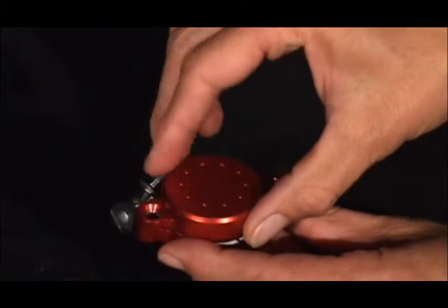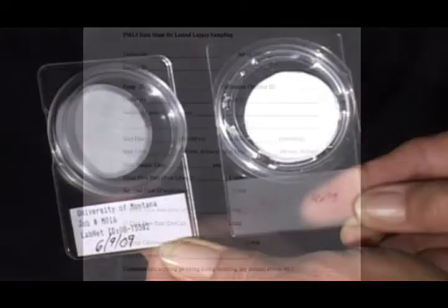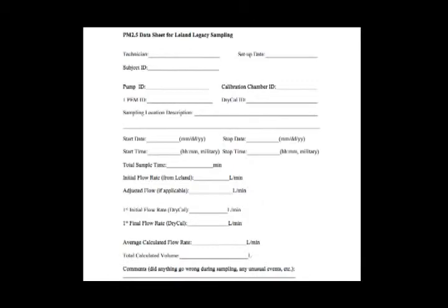After a sampling event, you will need to empty the PEM of its filter and safely store this filter. The first thing you need to do is get a Petri slide and label it. It is important to give it a good name. Include the date in your label and any other pertinent information. You don't want to confuse it with another filter. When you label the slide, include this name on your datasheet so you can match them up later if necessary.